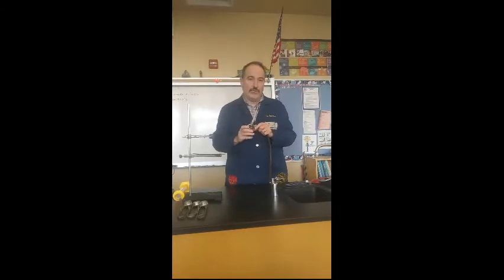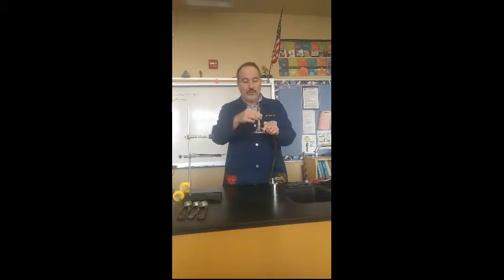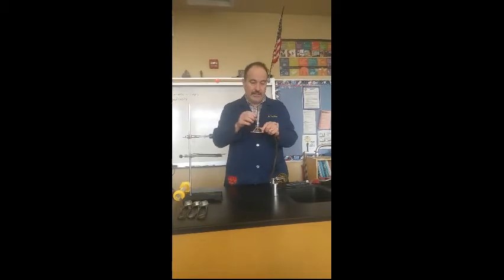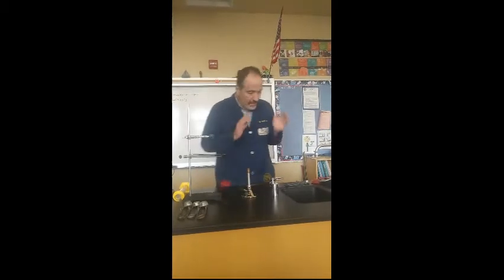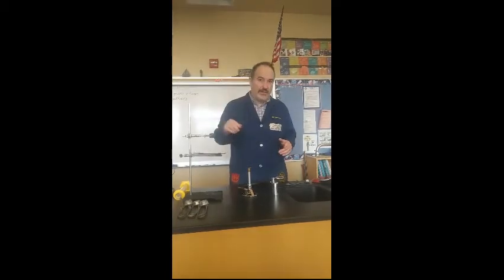What that controls is the temperature. The less open it is, the cooler the flame. The more open it is, the more oxygen comes in, the hotter the flame. All right? Now, when you're lighting one of these, there are like 5 steps that you got to do. All right? In no particular order. You just want to kind of mentally check them off.